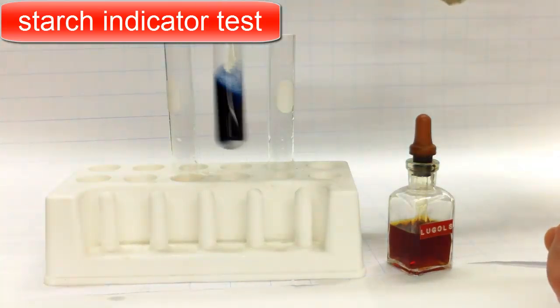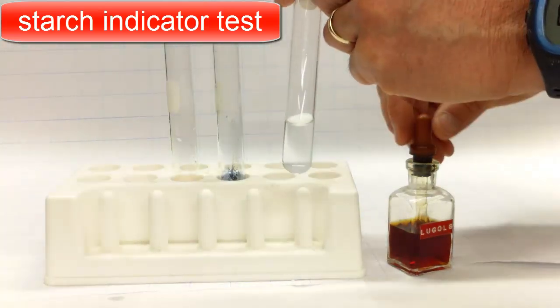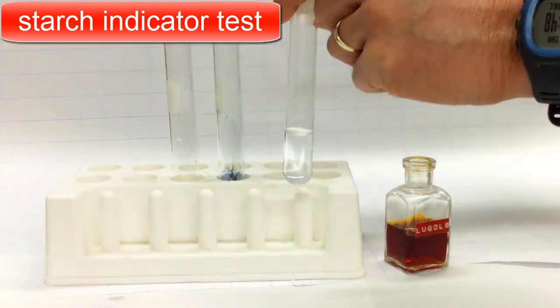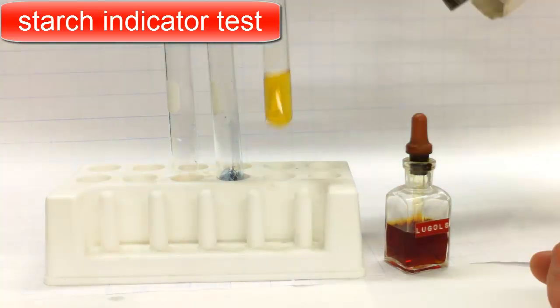Agitate it, and there's a reaction. Now we're going to put the starch indicator into the glucose solution, and there's no reaction.